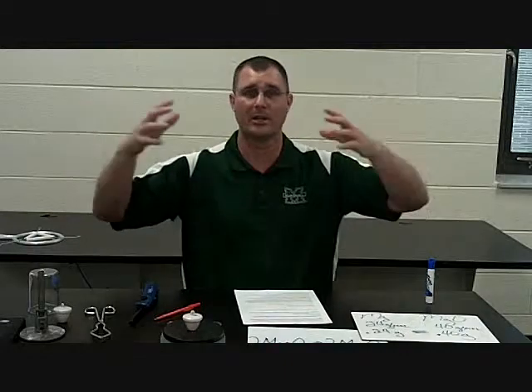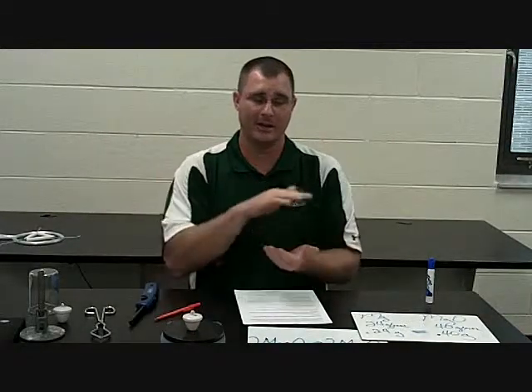It's actually pulling the oxygen out of the air and combining it with the magnesium. You never think about oxygen having weight, but it does. So when it combines, it adds that mass. All my kids said, well, what about wood? When I burn wood, it weighs less. Well, anything that has hydrogen in it, anything that has water, is going to combine with oxygen, and that water is going to evaporate, and we're going to lose it.